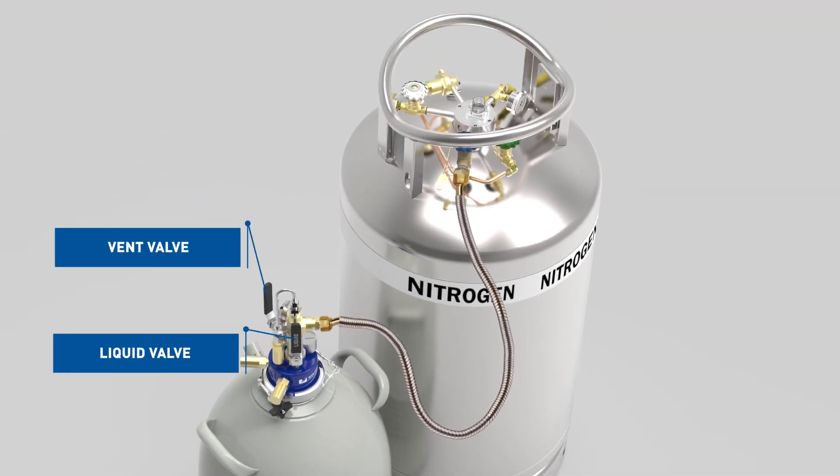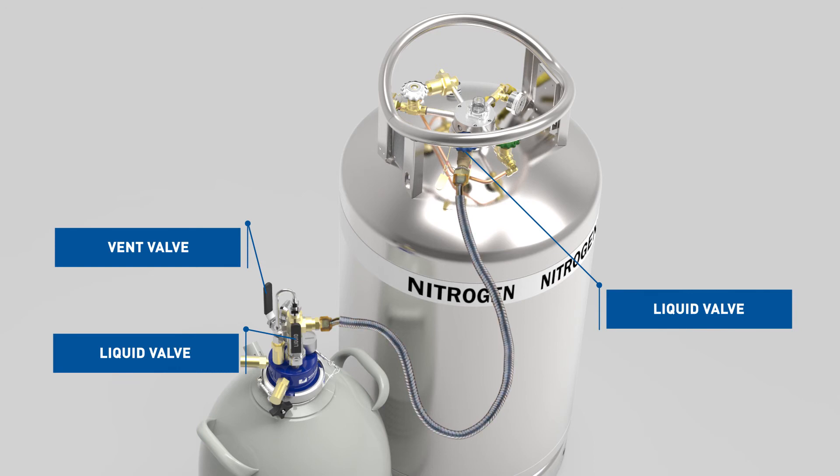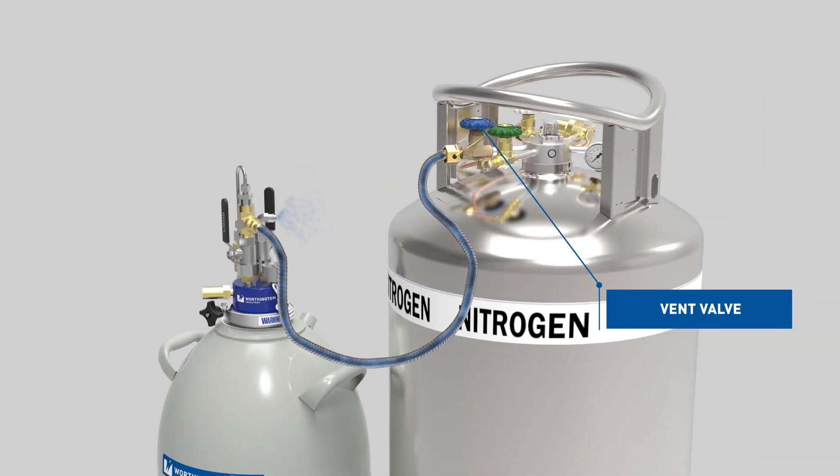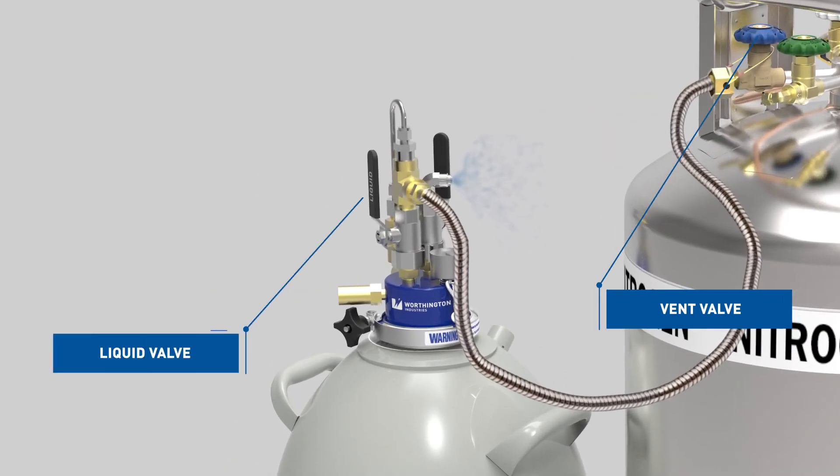Slowly open the liquid valve on the supply cylinder until liquid flow is established. Adjust the vent valve to maintain a back pressure of 7.25 PSIG or less in the Dewar. When liquid sputters from the vent valve, quickly close the liquid valve on the supply cylinder, next the liquid withdrawal device liquid valve, and then the vent valve.